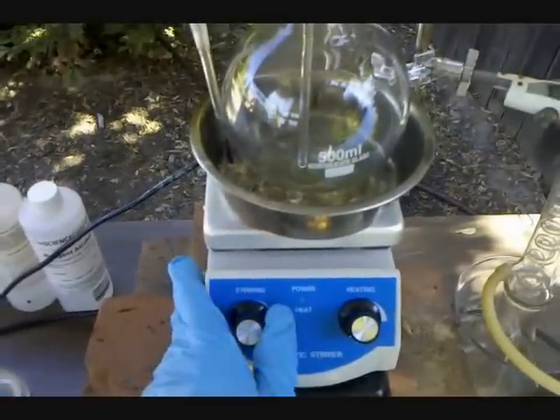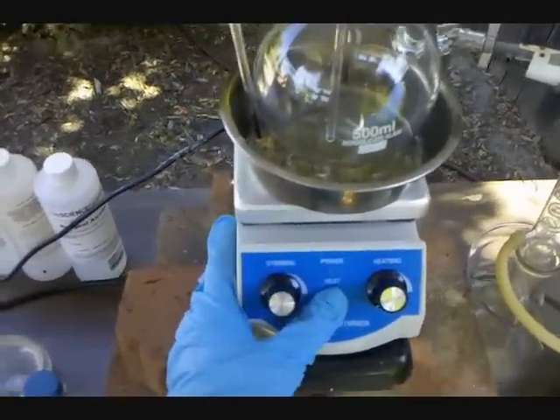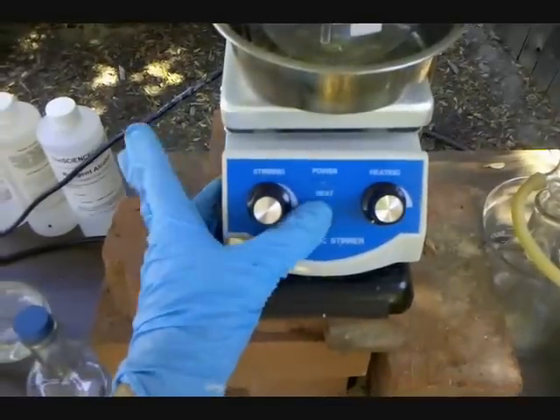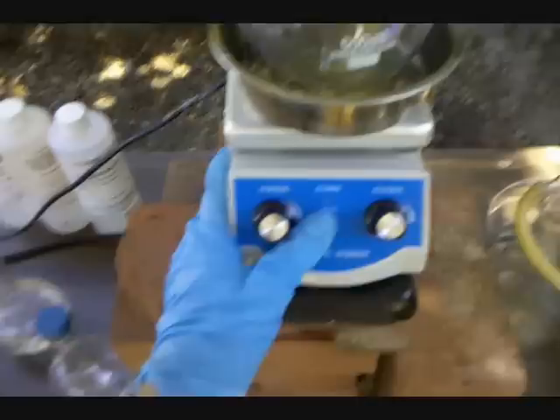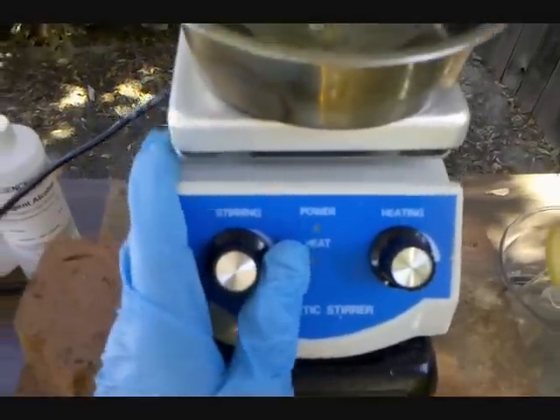First thing you'll notice is I'm using a hot plate as opposed to a torch like I did in my nitric acid video, and that's to eliminate the possibility of accidentally lighting the ether on fire, because an open flame would pose that risk and a hot plate doesn't.